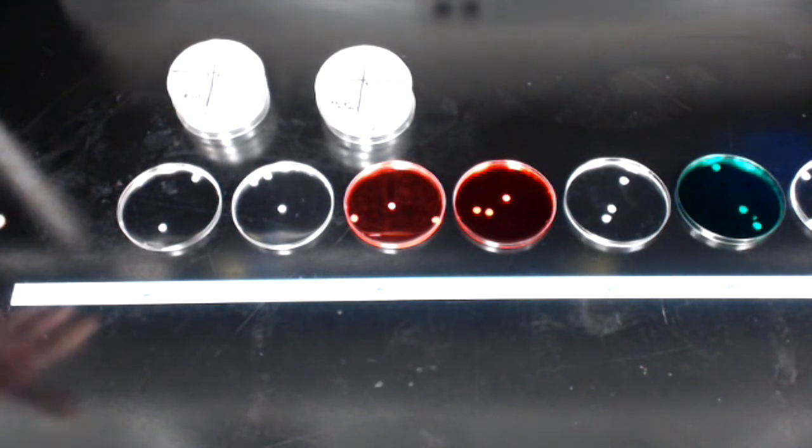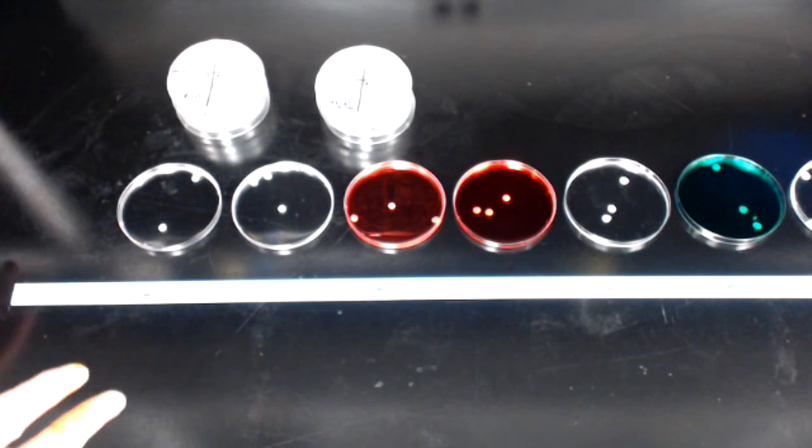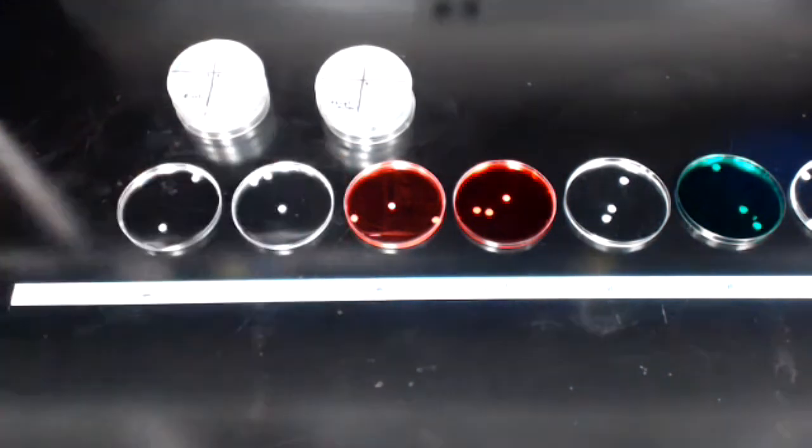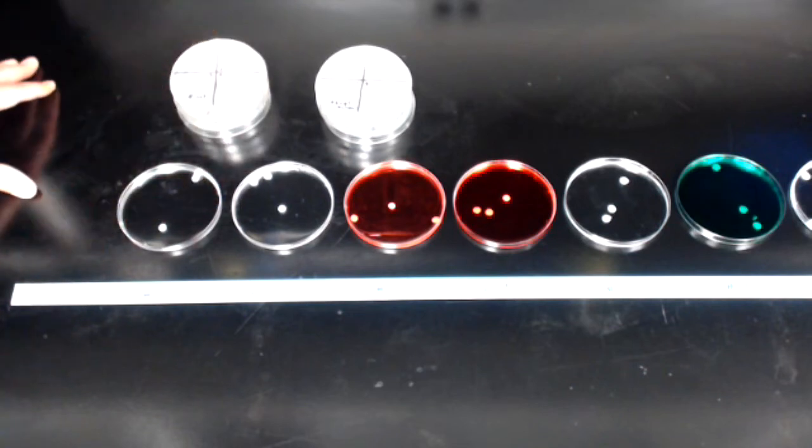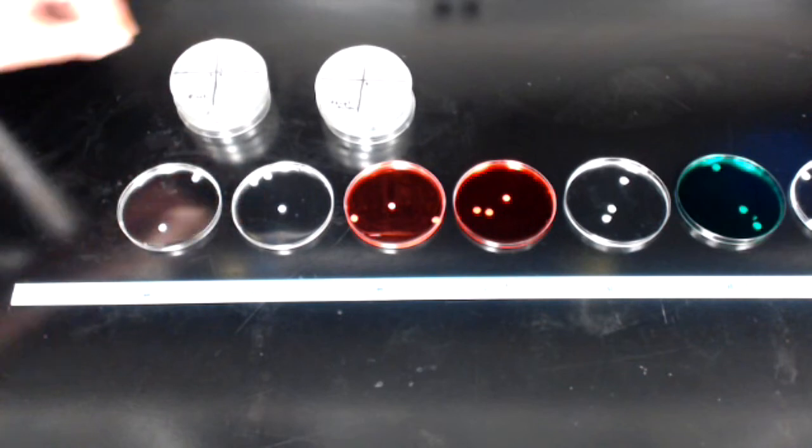Now what I'm going to do is demonstrate how I would transfer the paper discs that have been soaking in each dish of antiseptic disinfectant to the plates. Obviously, what I want to do here is make sure that all 12 chemical antimicrobials end up being put on these 3 plates of E. coli, 1 disc in each quadrant.